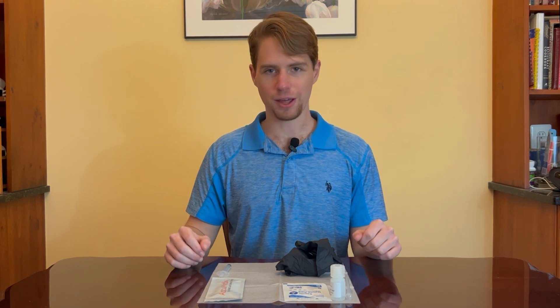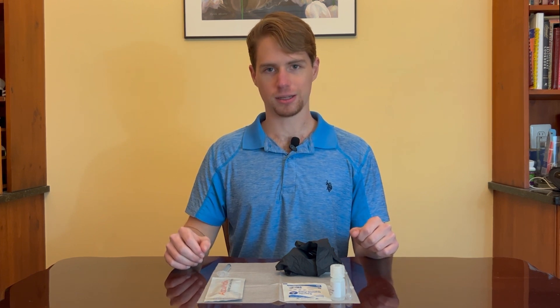Hey there. In this instructional video we're going to go over the AccuMeth instant methamphetamine residue test. The AccuMeth test kit will help you to determine whether or not a specific area is contaminated with methamphetamine in as little as just five minutes.